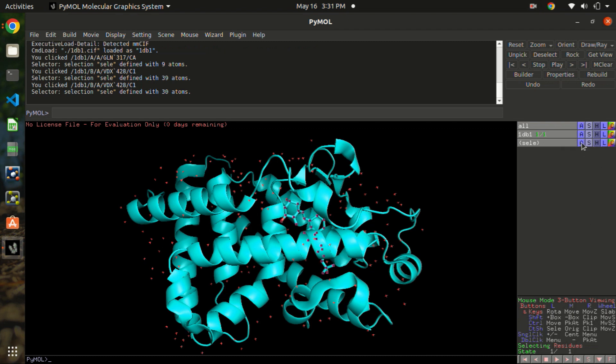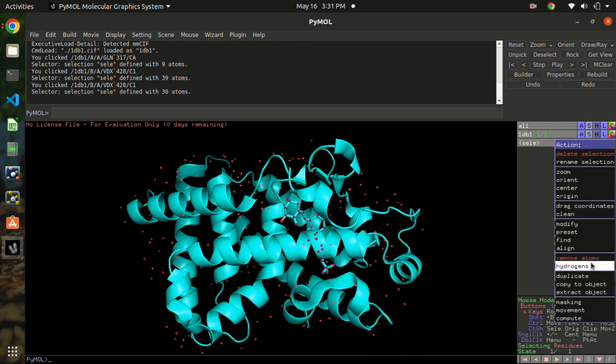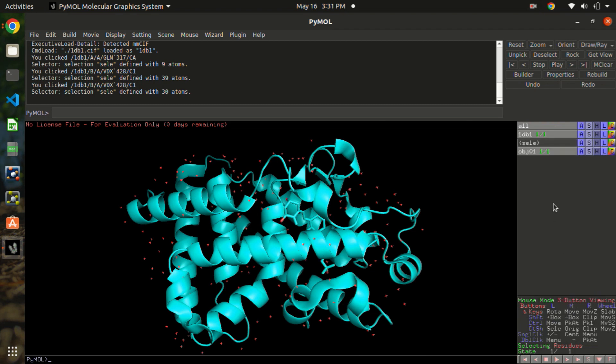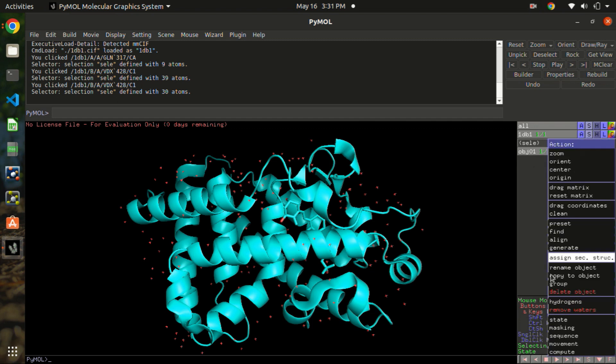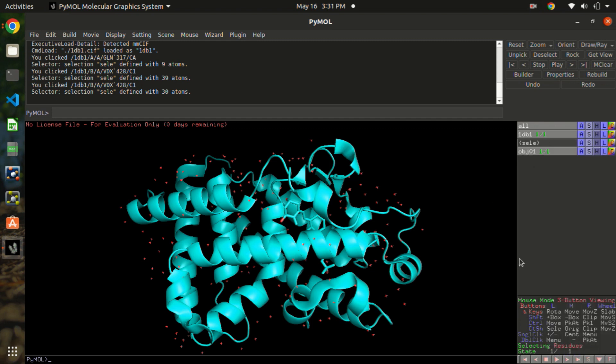Now you would like to extract this object. It is named as obj01, but if you want you can always rename this object from here. But we are going to keep it as simple as that.